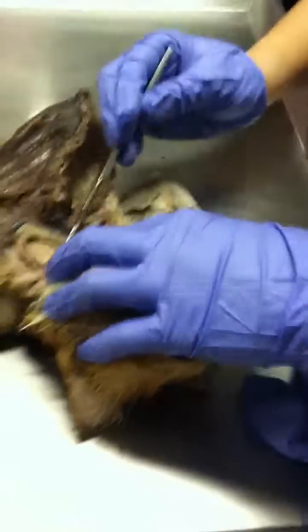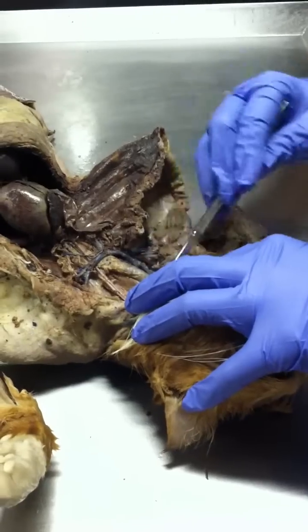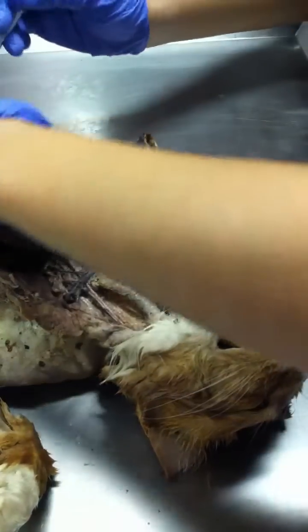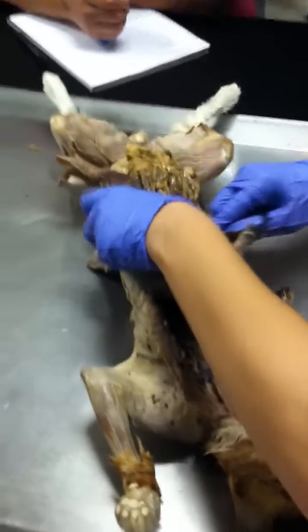If we move away the trachea, right? Remember the esophagus behind it? If I pin the structure, esophagus, right? Esophagus goes all the way down, pierces through the diaphragm, boom, and it's going to go to which structure next? Stomach. The stomach. It's going to go to the stomach next, right?